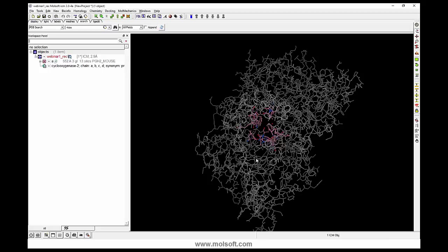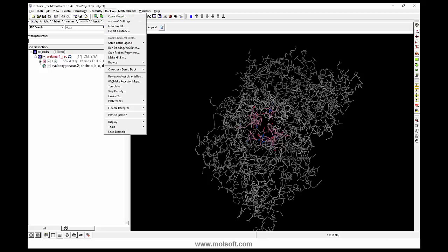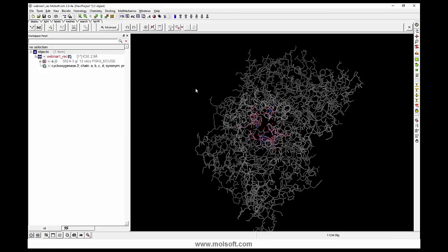You could use this procedure for peptides, but you wouldn't. There are usually a lot of rotatable bonds in peptides, so you need to increase the thoroughness value. You could also use the protein-protein docking options here. And if you have a peptide receptor complex already made, you can use the ligand editor to dock it and make modifications to it in the ligand editor tab.